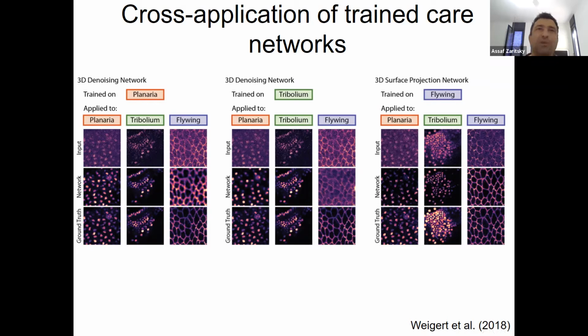When we train our model on one system, will it generalize to something else? And in microscopy, it's a big deal because the data is generated in so many different ways. You have different systems, and even yourself on different days, they can feel a little bit different. The microscopes are different, everything is different. There is so much variability within these systems, which makes it very challenging. So if you can show that your system can generalize across imaging conditions or models, it's very powerful.